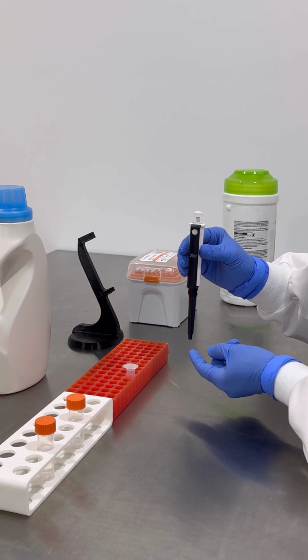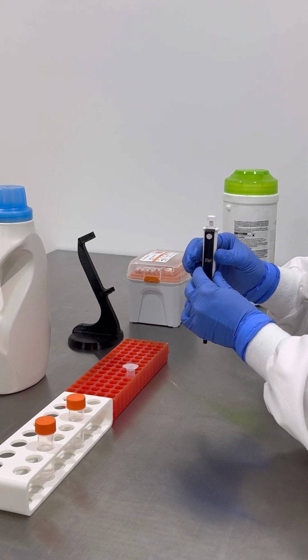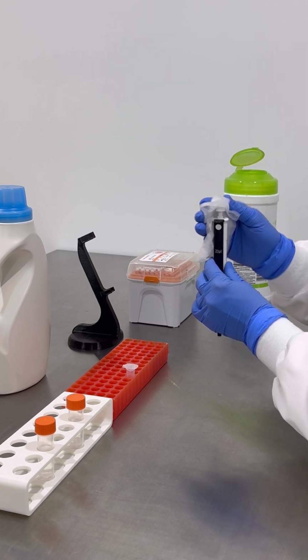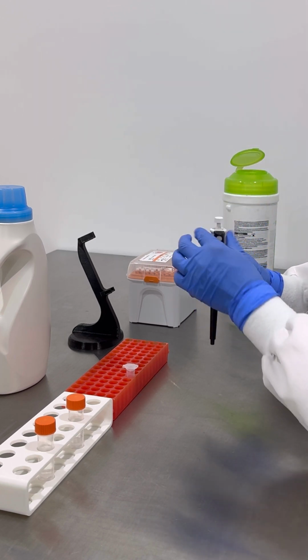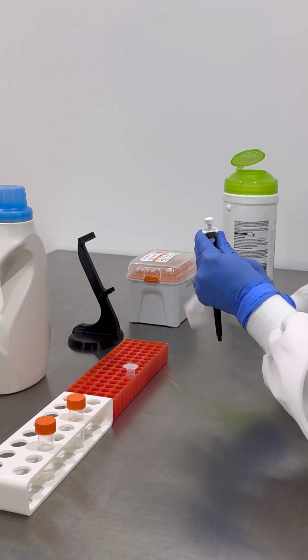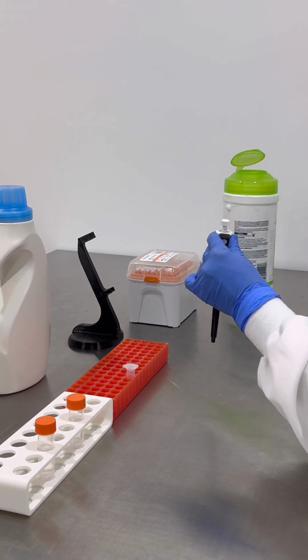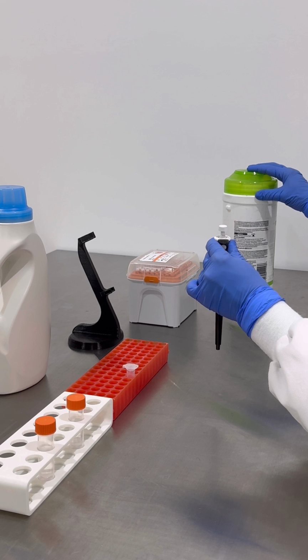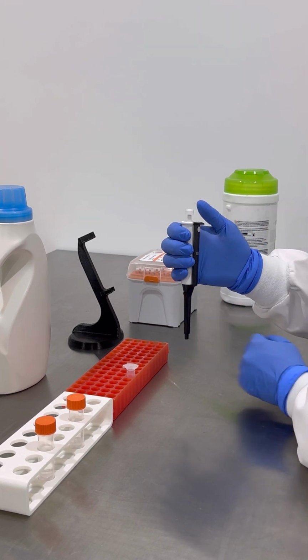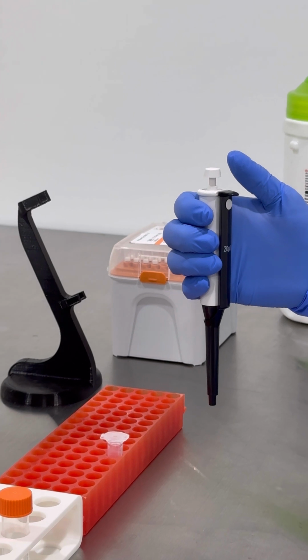Wear gloves and clean the surface of the micropipette with an ethanol wipe at the beginning and at the end of your work. You should also clean with an ethanol wipe if you suspect contamination of the surface has occurred at any stage.